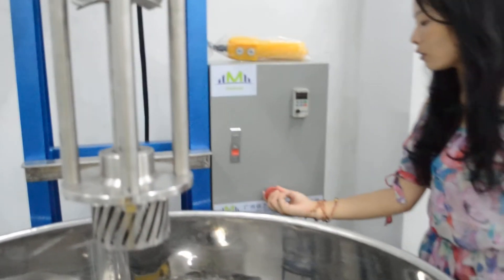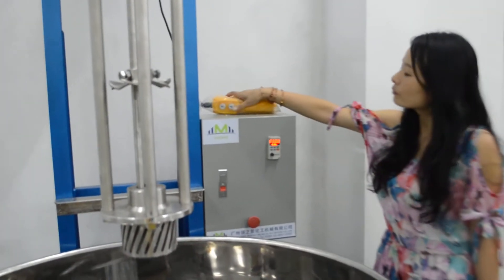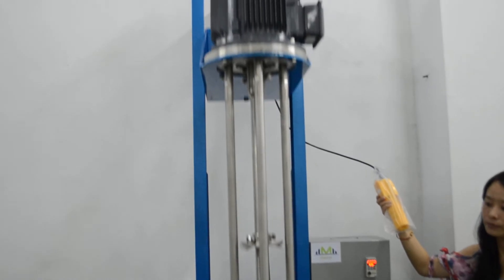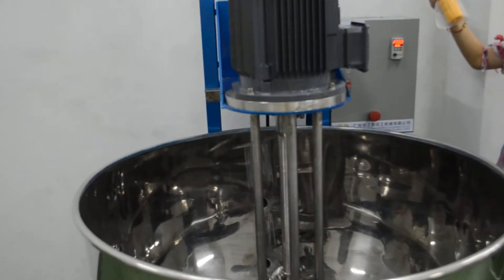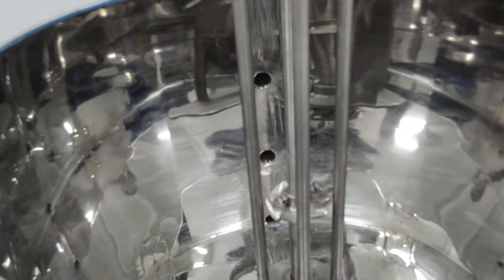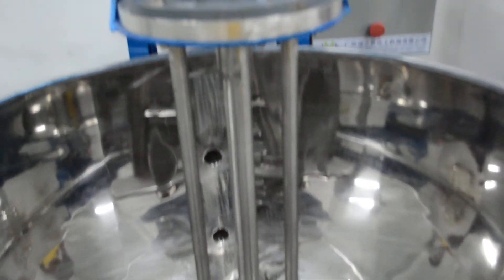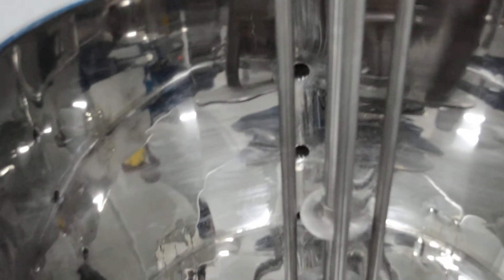Switch on the electric force. Come down the mixer. We're going to blanket the material. Speed is adjustable.